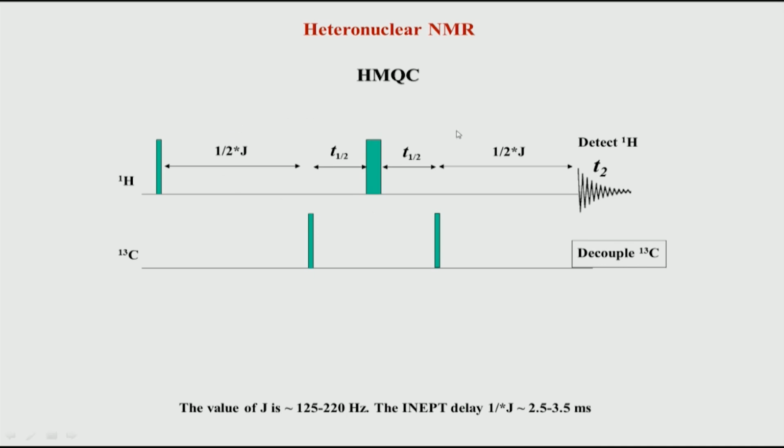So, let us now look at HMQC. It is a much simpler experiment in terms of the number of pulses in the sequence. Similar to what we saw in HSQC, you need to transfer polarization from proton to carbon, and that is typically done using an INEPT block. But this INEPT is not the same as the INEPT you saw in the HSQC experiment, because remember we saw two 180 degree pulses and so on, but without these 180s we can also achieve this transfer, and that is what is shown here, but it is slightly different. So, we will still call it a regular INEPT.